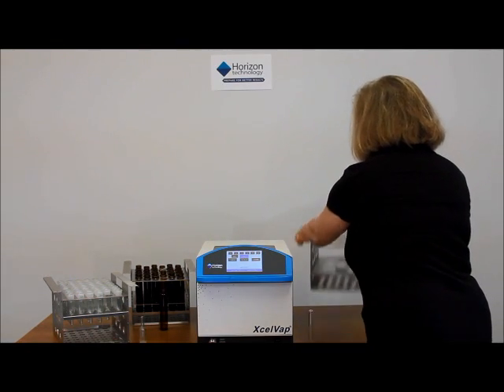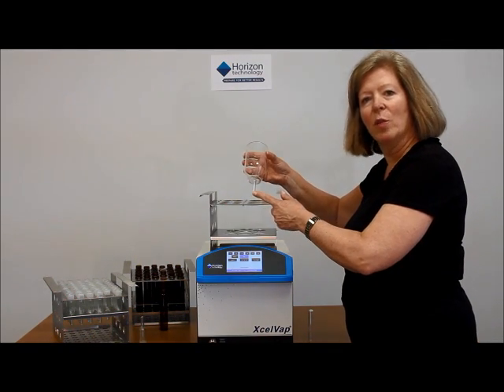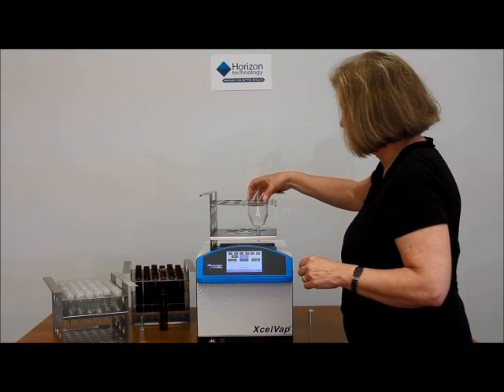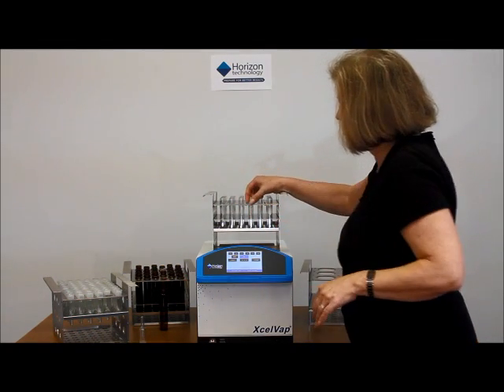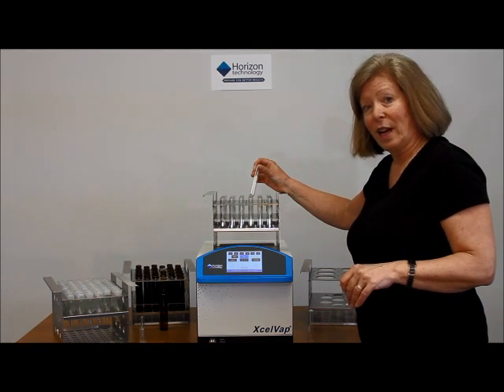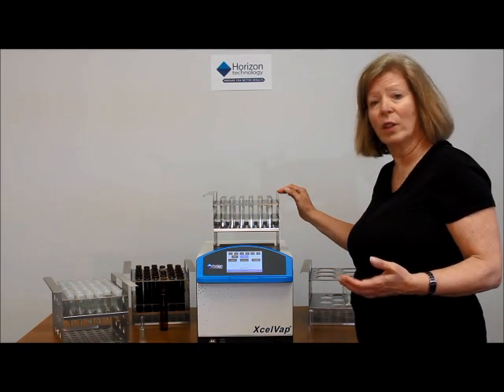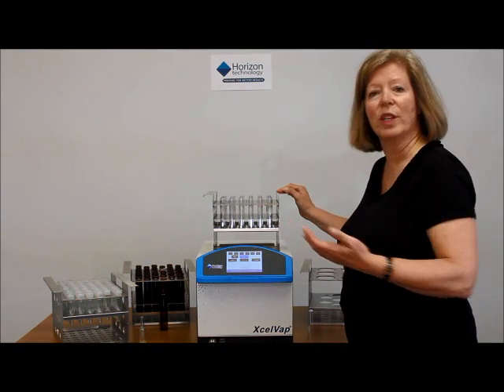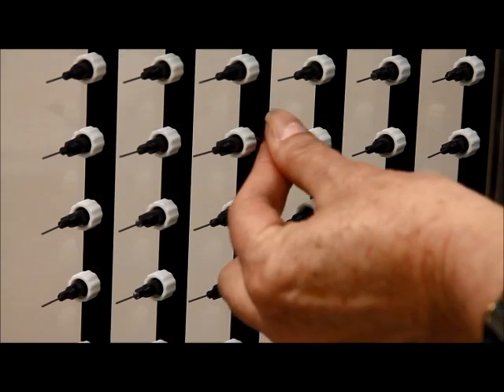For example, here's a six-position rack with 200 milliliter glassware — you can see a specially designed glassware with a nipple at the bottom, which slows evaporation as it approaches the end point. Or a rack such as this one with 54 small test tubes, which would be appropriate for a clinical or toxicological lab. Whether you're a small or large laboratory, you can change the glassware for whatever orientation you need that day. The gas nozzles are very easy to remove and replace if there's any clogging or if one of the nozzles becomes bent.